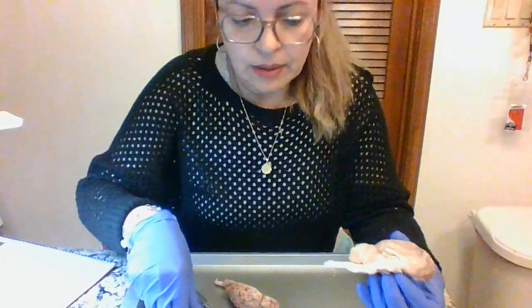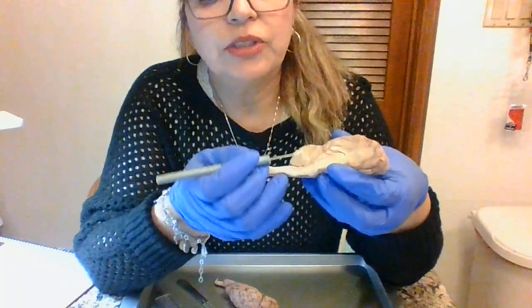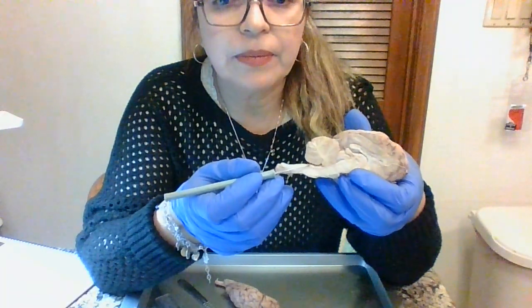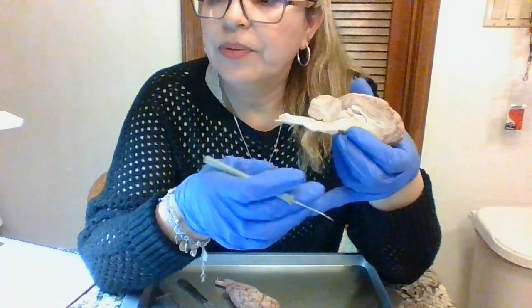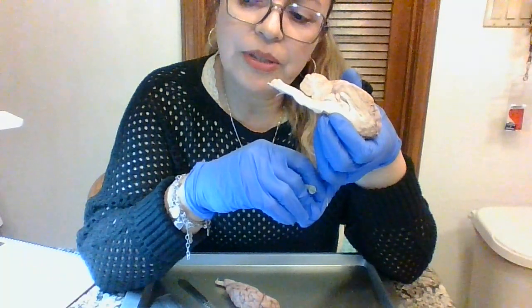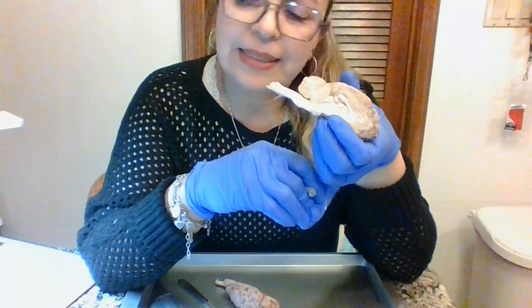Next thing is the lateral ventricle. The lateral ventricle is this gap right here. Okay, it produces and circulates cerebrospinal fluid and transports nutrients and removes waste.